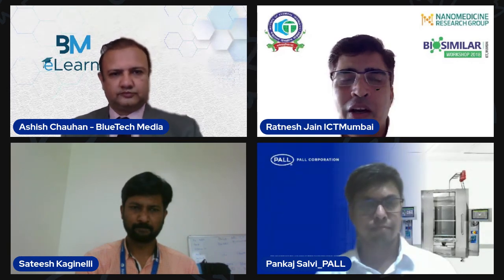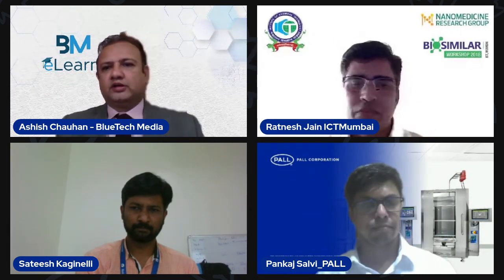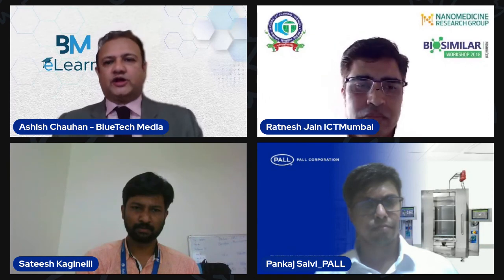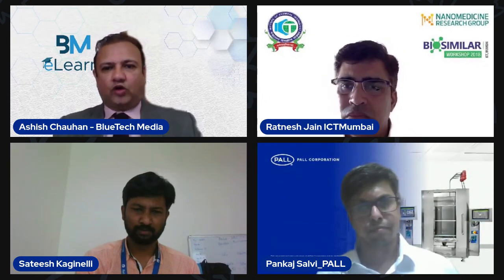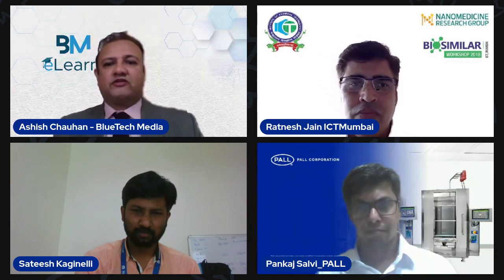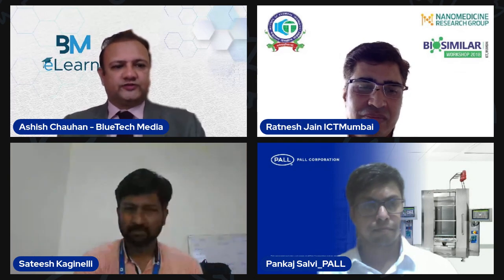Yeah. Thank you. Before we move ahead, one more question for Satish. We are just running out of time. We'll just take one question each now. Microcarrier suspension based Cytodex or fixed bed PALL iCELLis, which platform is better for adherent cell culture? Satish, this question is for you.